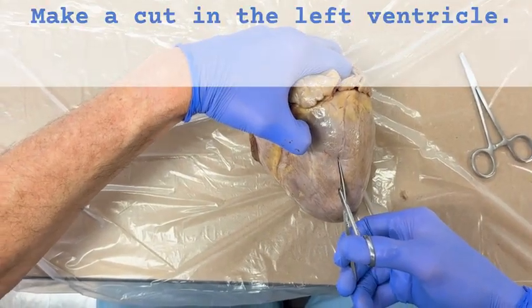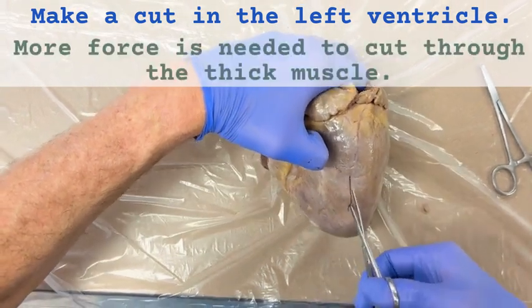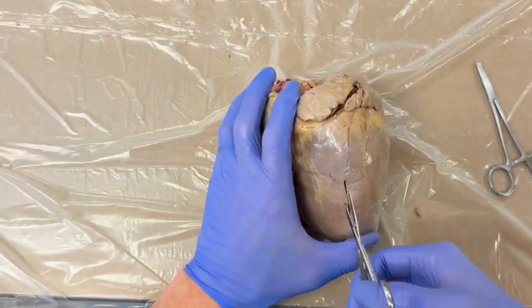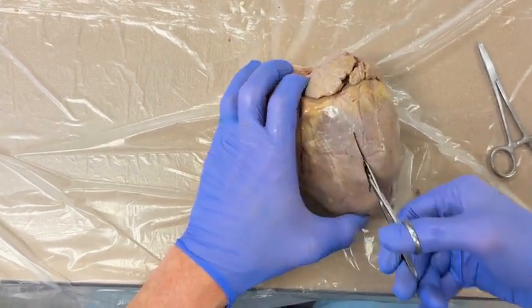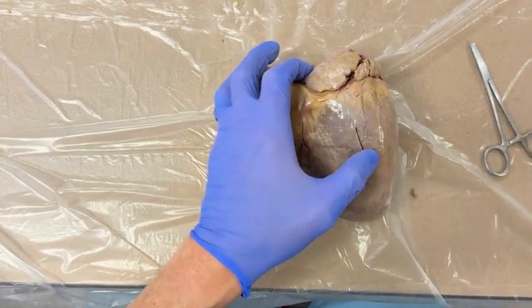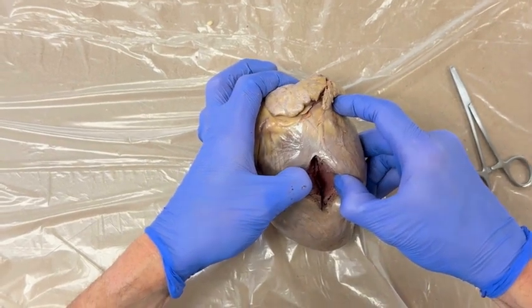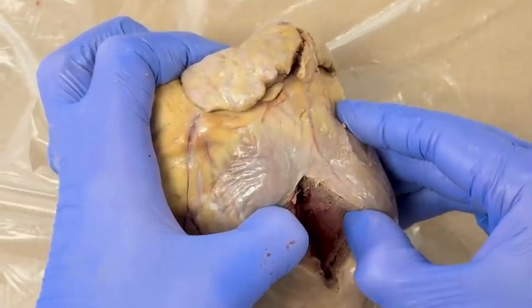So we're going to make a cut here in the left ventricle, and it's very thick, so I have to apply a lot of force, and I'm making sure to get my finger well out of the way of this. It's just barely enough. You can see how thick and beefy the left side of the heart is.